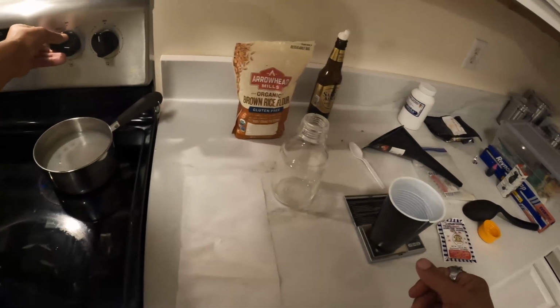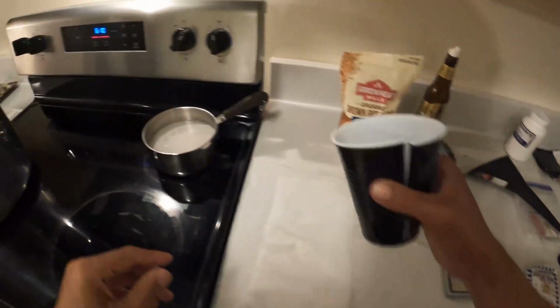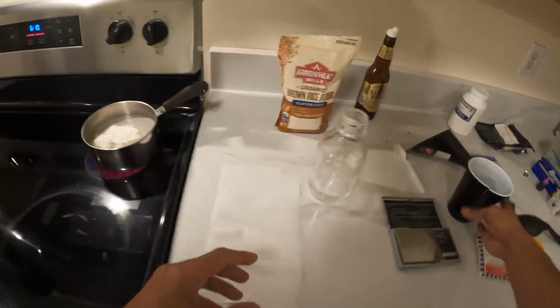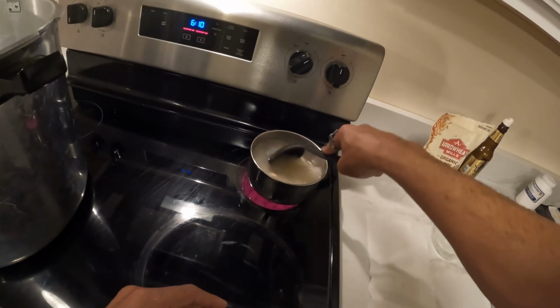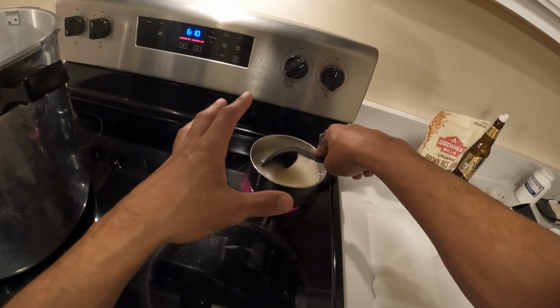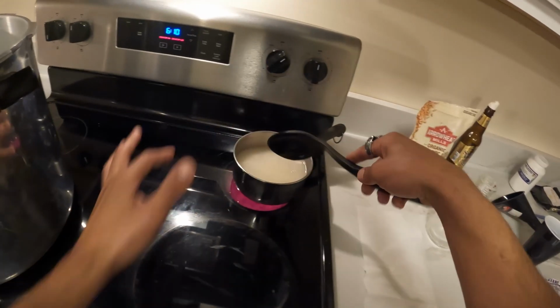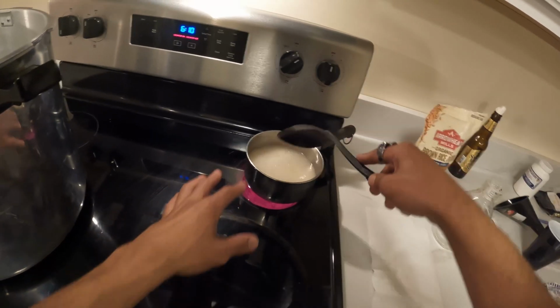So we're going to go ahead and turn the stove on and bring that to a boil with our 8.5 grams of brown rice flour and our 10.5 grams of agar. Due to the fact that we're going to lose some of the agar in the process, it's going to just be on the spoon here. You'll be able to see it gel up, and you'll probably see some on the bottom of the pan.